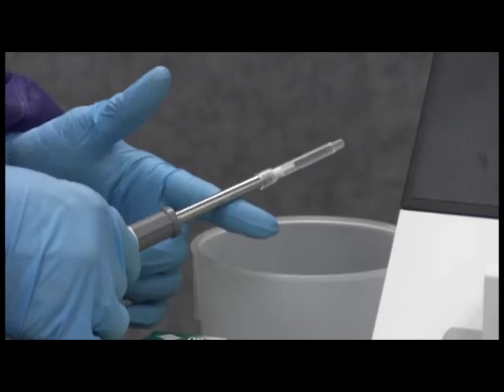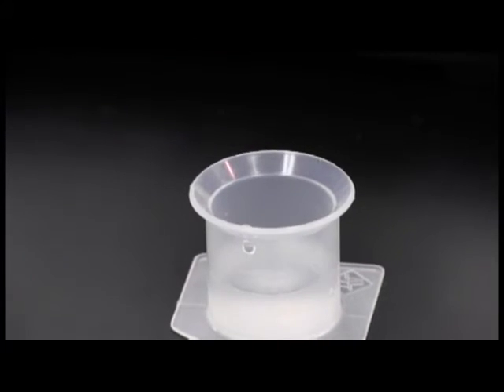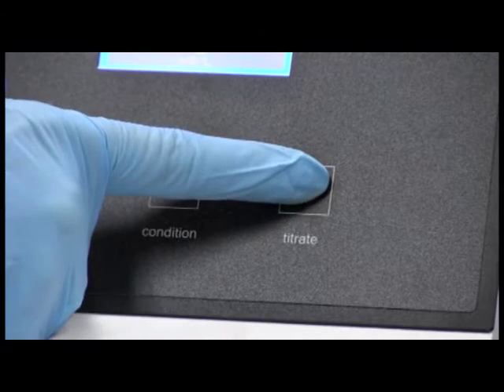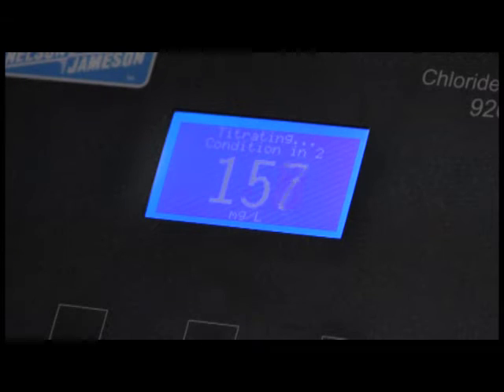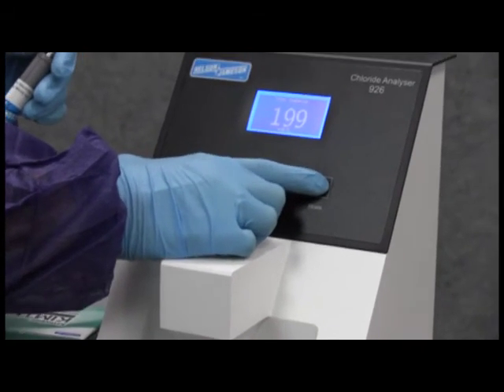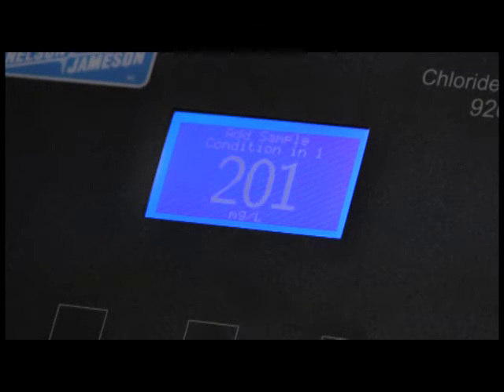Using the same technique mentioned earlier, flush and wipe pipette, then fill with 500 microliters chloride standard. Deliver to conditioned acid buffer and press titrate. The analyzer will count in milligrams per liter. At the end of titration, record the result. Keeping the cup raised, perform at least four additional titrations of standard and record results. After each titration, the displayed result should read 200 plus or minus 3 milligrams per liter chloride, and the average mean value should be 198.5 to 201.5 milligrams per liter. This ensures pipette repeatability. If within this range, you may proceed.